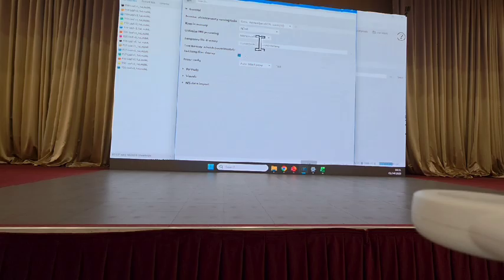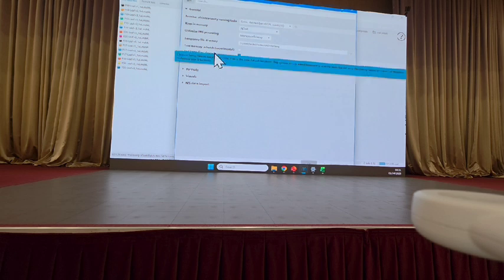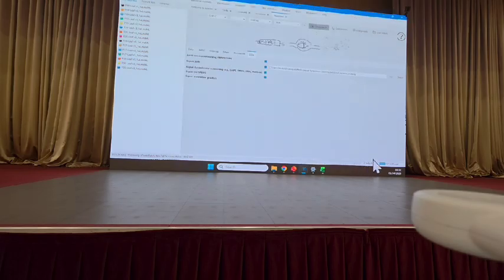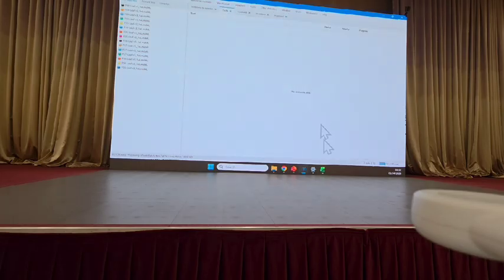I have mine set to my desktop, so if you didn't set it, hopefully the default location that it has is fine, or sometimes it will just put the temporary files in a quick temp folder of its own. And depending on how fast your computer is, you might be finished. It says 2 tasks left, but sometimes there's no content left. I can tell you that's just thinking it still has 2 tasks, but it's done. If you weren't sure, if you open up the tasks tab, you will see if something is still listed there.